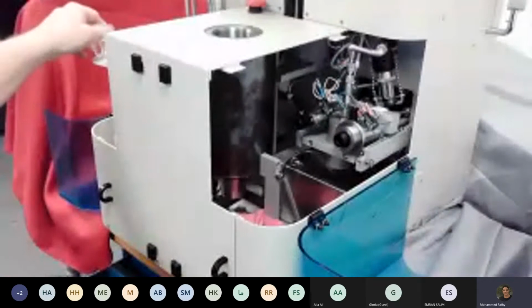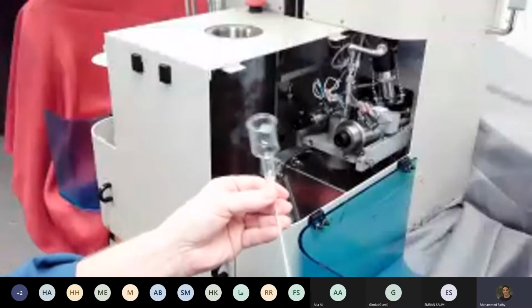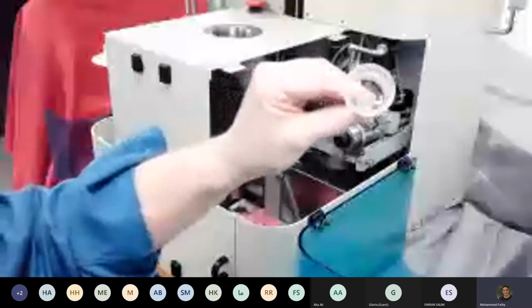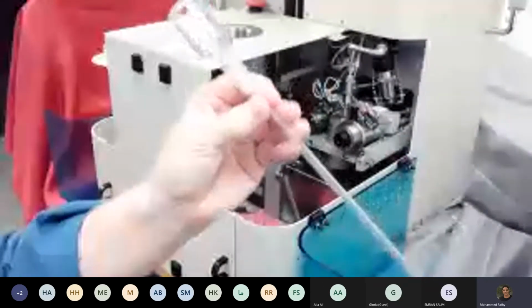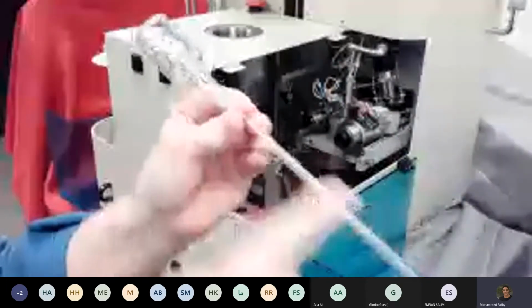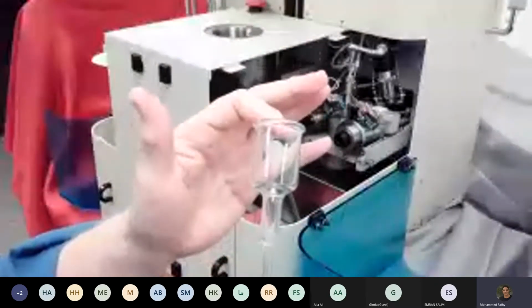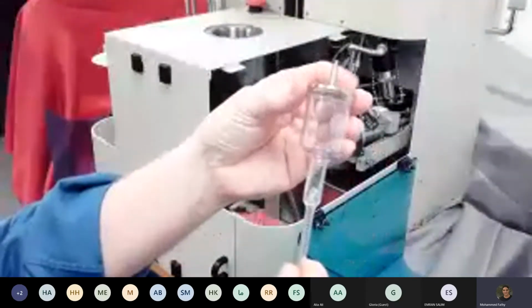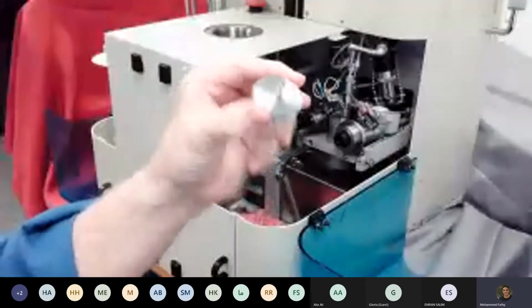Now, to put the sample cell together, I promised I'd show you this. This is what we call a macro cell. It has the capacity for a 1-inch core cylinder. Maybe I'll show you that a bit closer. Okay, this is the stem, along which the instrument senses how much mercury is moving in. Once the sample is added to the cell, then we put on a metal cap. We just use some simple vacuum grease here to make a vacuum tight seal.